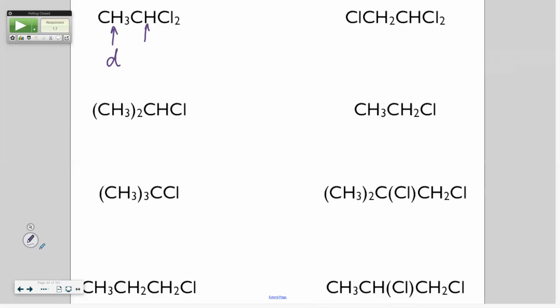Okay, this one. Do you see that these peaks are not pretty singlets? That's what we're doing. We're figuring out what those mean. D means doublet. I'll write it so that we get it up here once. So this one is a Q, Q for quartet. Yeah, it's not duet, it's doublet.